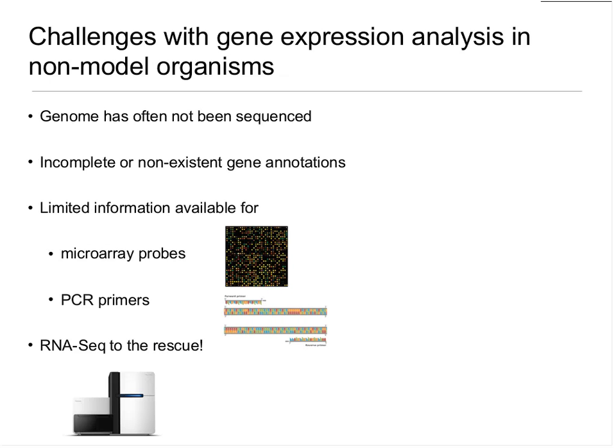Okay, so there are a number of huge challenges with analyzing the molecular biology of such species, and in particular what we're interested in is what are the genes that are responsible for the amazing regenerative ability of the axolotl salamander. So how do we get at that? Well, one thing that's making this very difficult is that the genome of the axolotl has not been sequenced, as are the genomes of many non-model organisms.